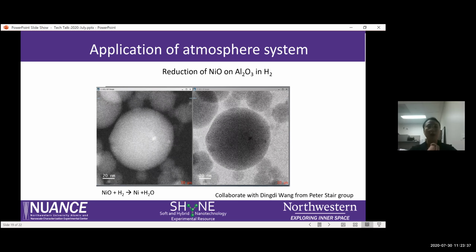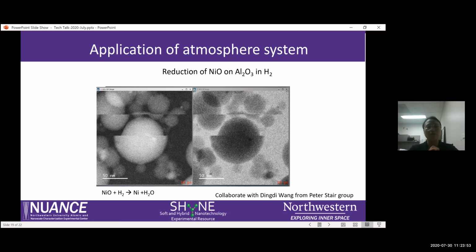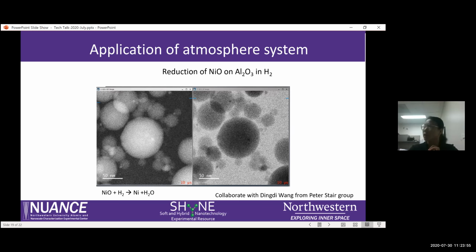This one is the one we want to do the demo of the RGA, but we didn't get it before the pandemic period because something was wrong with the RGA. We sent it back for fixing, and currently we have it back and fixed. We will do the testing of the RGA in the following months. We're trying to demo a similar chart to the one the Professor got.